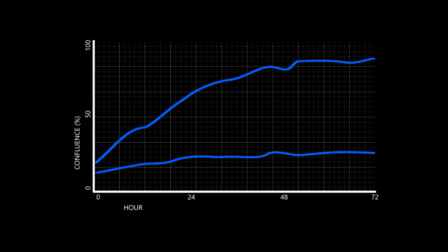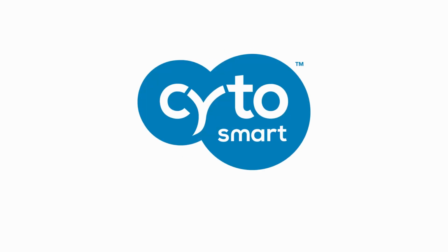or migration. Here, the cell confluency of both samples has been plotted in a single graph to compare the proliferation rate over time.